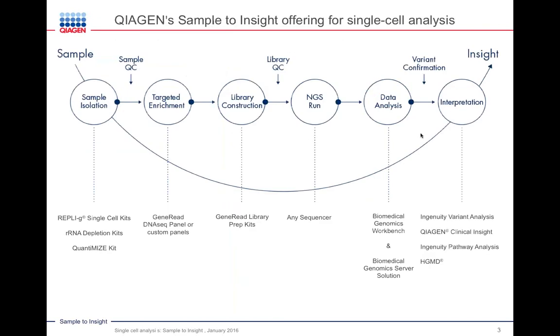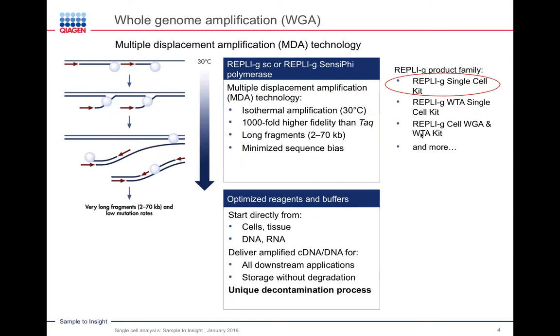So I'm going to now go through each of these steps that we highlighted here as part of our whole overall system one at a time, starting with sample isolation.